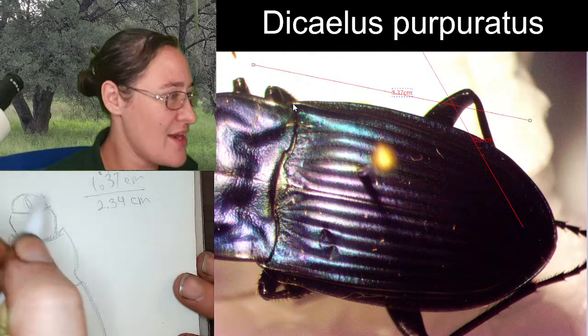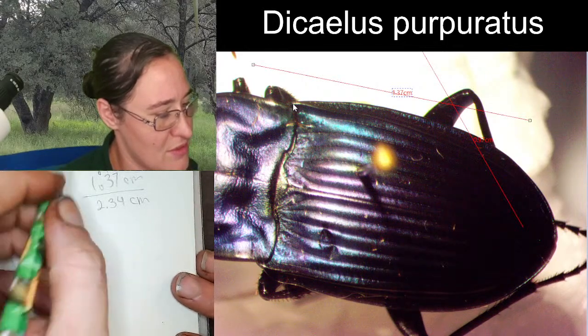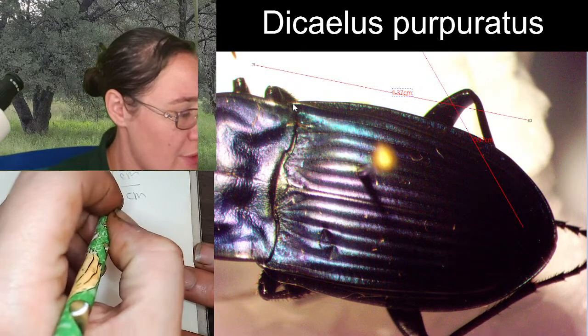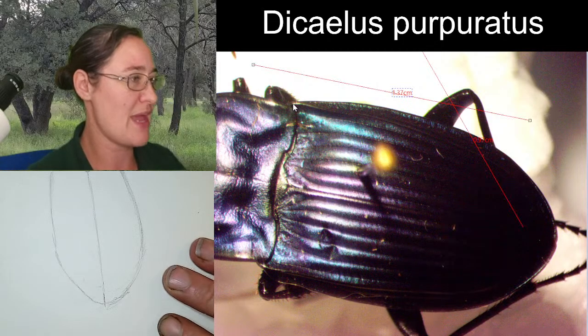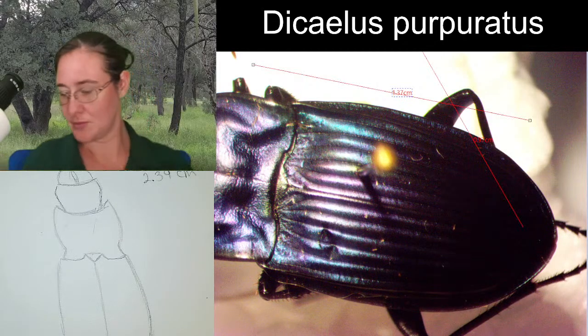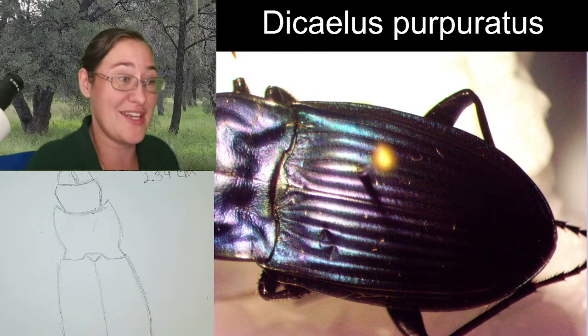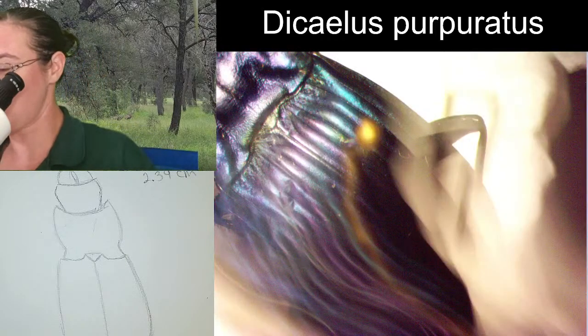Let me do that again, just make sure. We have a combined length of 2.34 centimeters from the front of the head to the back of the elytra. It's a decent-sized beetle. I mean, it's not a small beetle, and it is a predator, so it has some pretty wicked awesome jaws. Let's go check them out.